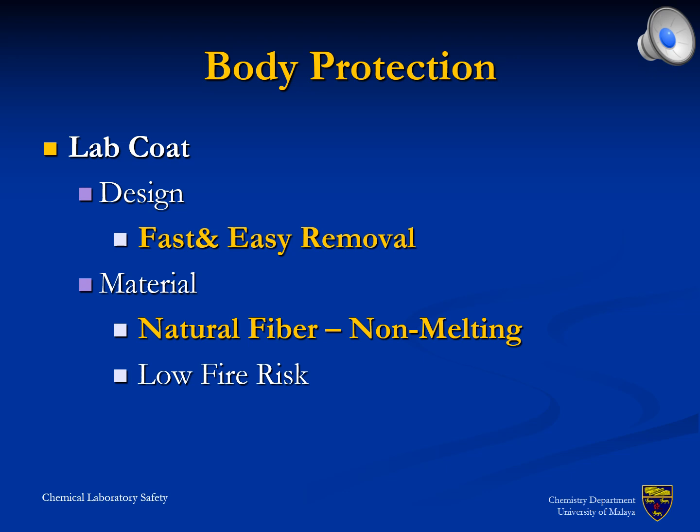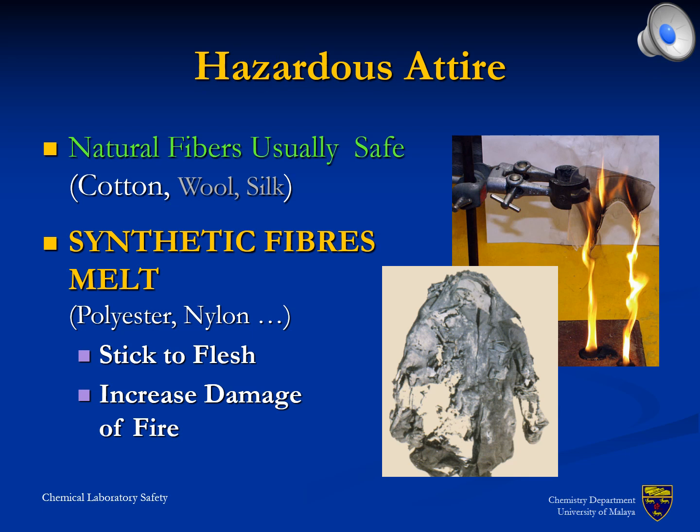Moreover, the material is selected from natural fiber, which reduces the hazard in case of fire. Natural fibers, particularly cotton, are not fireproof, but burn only moderately and leave a brittle ash network. This behavior substantially deviates from synthetic fibers, which catch fire more easily and typically melt upon fire exposure. The effect of the melting is a shrinking of the fabric and sticking on the body. Synthetic clothes are, therefore, difficult to remove in case of a fire, and enhance the chances for severe body damage.